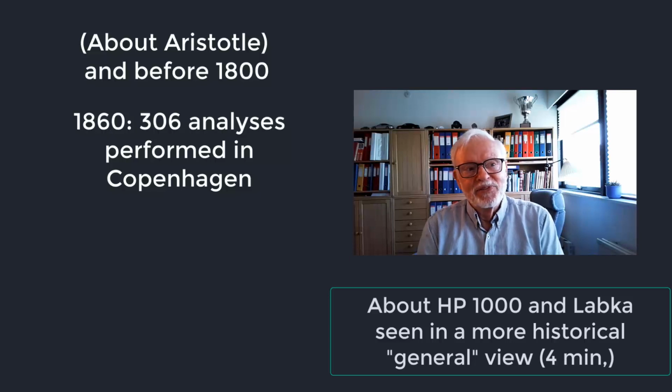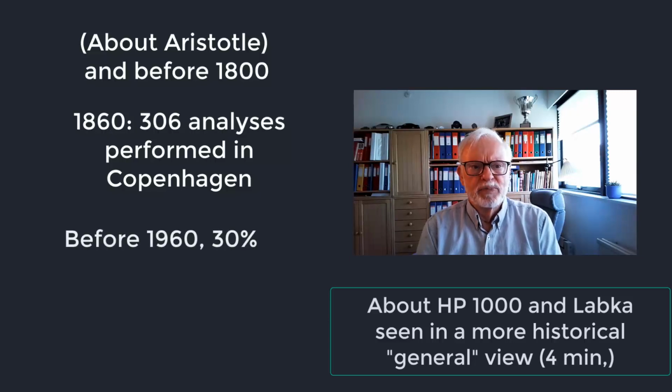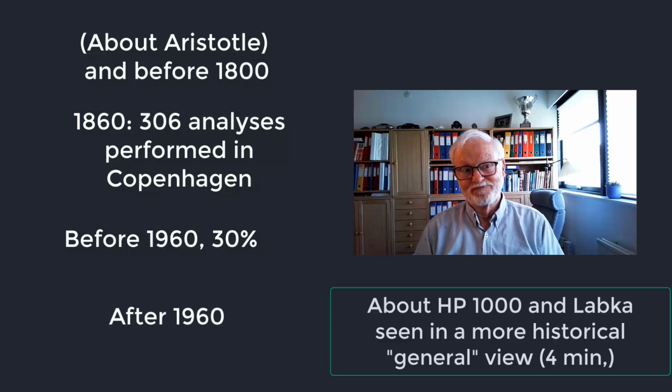But scientifically, development has already taken off. But I do not have the prerequisites to describe scientific development. But I can, for example, state that before 1960, the lab technician used approximately 30% of the work in the laboratory for administrative work, including calculation work. That was before the microprocessor came out.